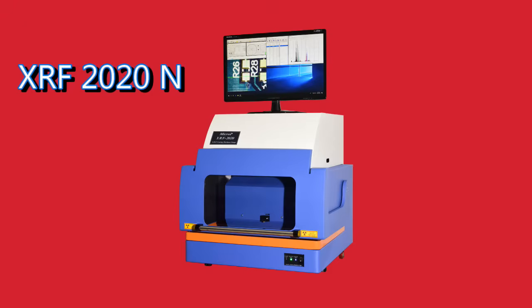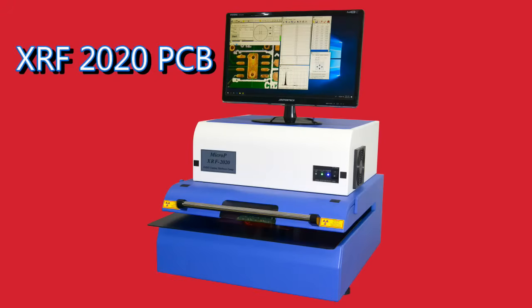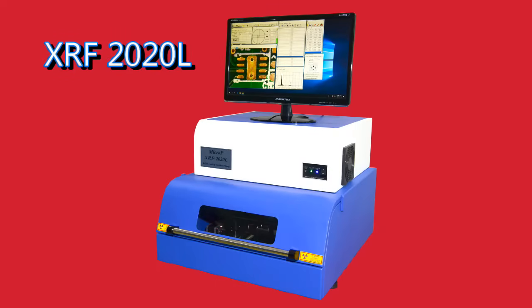The XRF 2020 features four chamber designs and comes equipped with either proportional counter, pin diode, or SDD detectors. The XRF 2020 series has the exact model to meet your requirements.